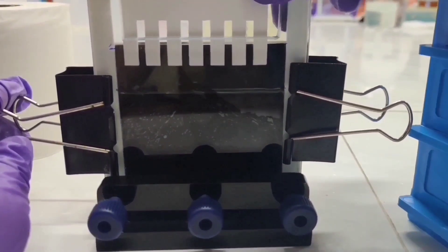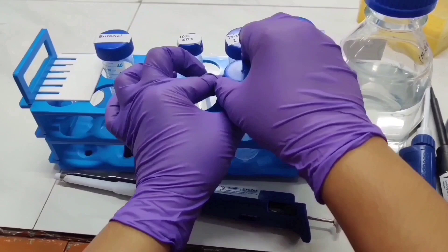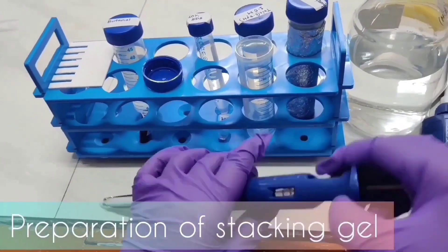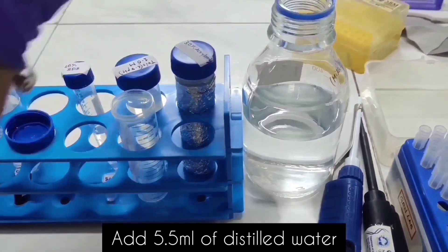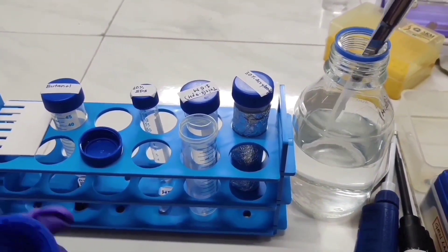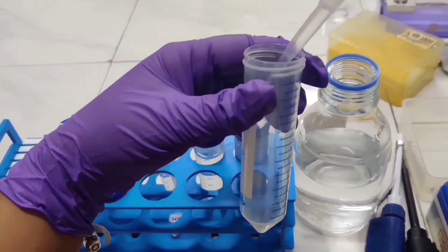We insert the comb on top with approximately one centimeter gap. We start preparing the stacking gel, which contains water, 30% acrylamide, 1 molar tris with a pH of 6.8, 10% SDS, 10% APS, and TEMED. Make sure to mix after adding each component. Adding 30% acrylamide allows the protein to move faster and concentrate in a neat band prior to being separated in the resolving gel.